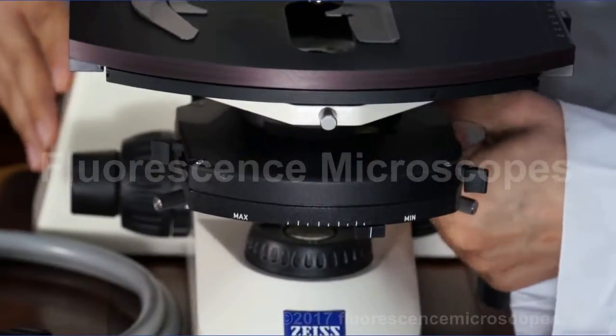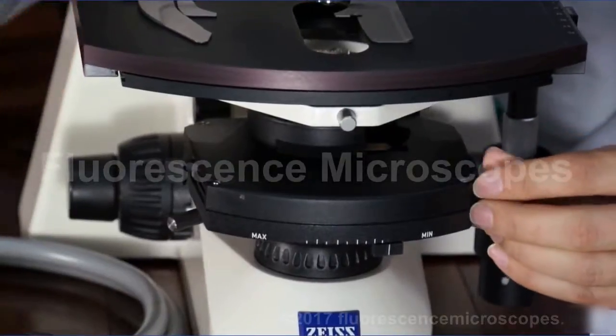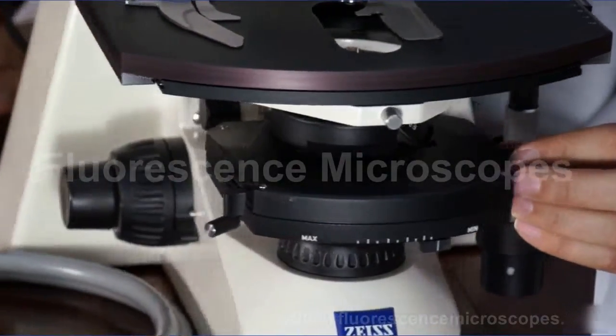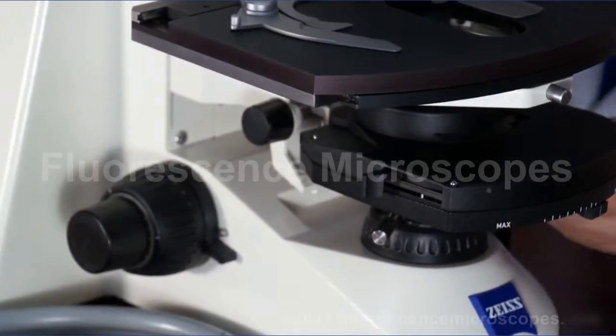The condenser has a flip-top on it. This is a flip-top portion. You would use this at the lower power objectives, like a 2.5 or in this case a 5x.